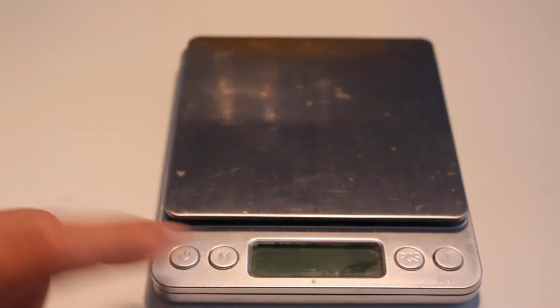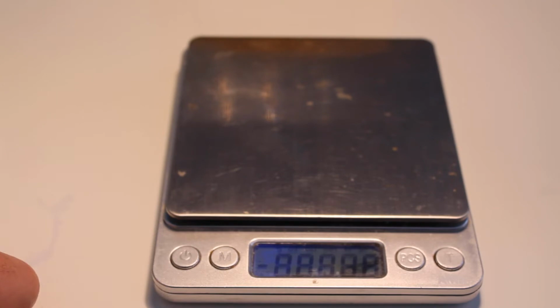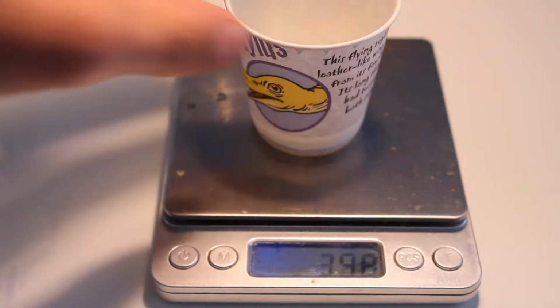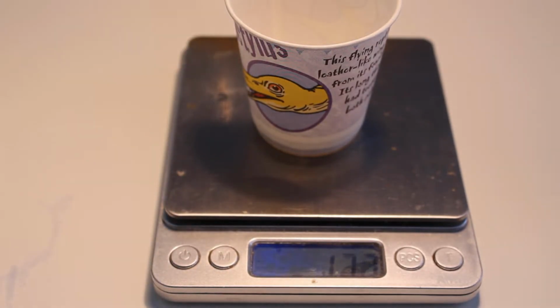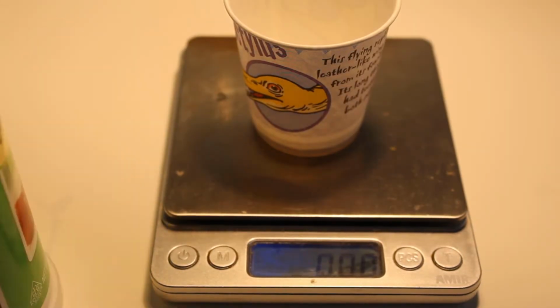So first, we'll need to measure out. There it goes. This scale has seen some abuse. First we'll have to measure out, I'll have to see the ratio. But let's zero it first, and then I'm going to check the ratio. Okay, so let's begin. First we're going to have to measure out citric acid.